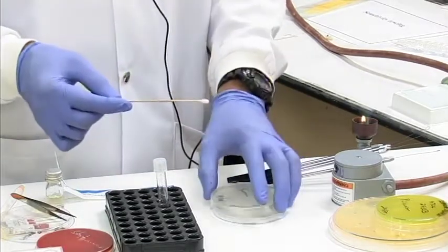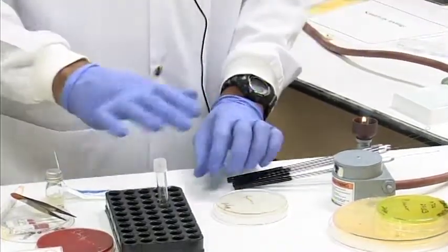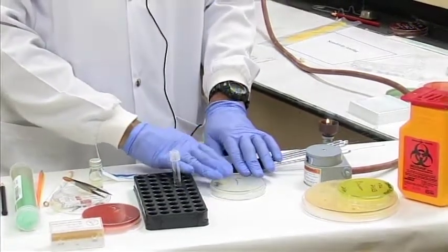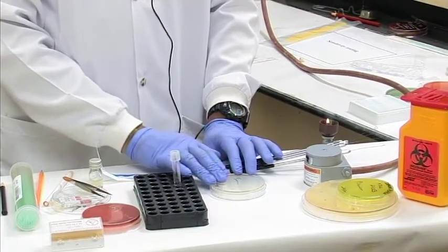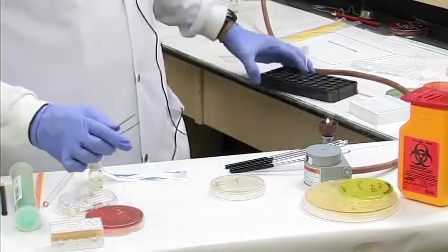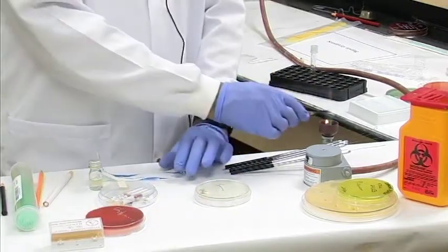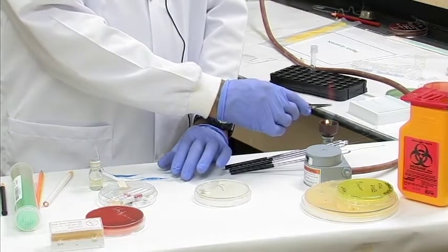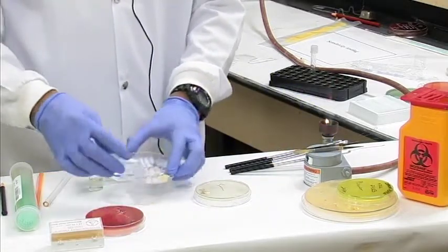And this is done to create a nice constant inoculum so the bacteria is spread out across the plate. This now has to sit and dry for about 5 minutes. Within 5 minutes to 15 minutes, you're going to apply your antibiotic disc, which is here. So to do that, you will need a forceps, which must be flamed and cooled. So you flame it. It must be cooled. And you have your choice of antibiotic disc.